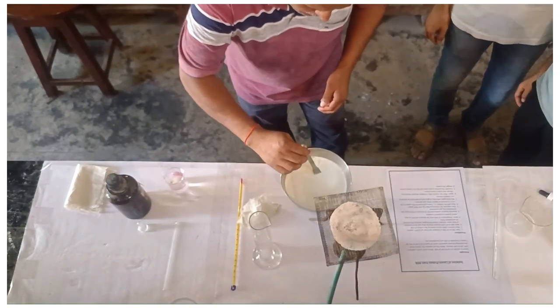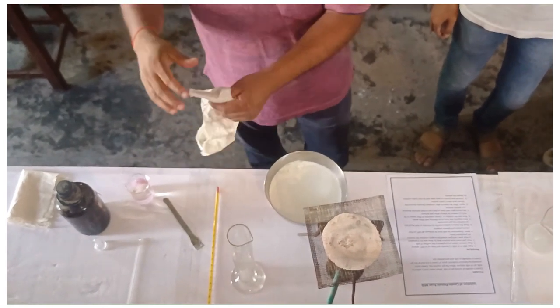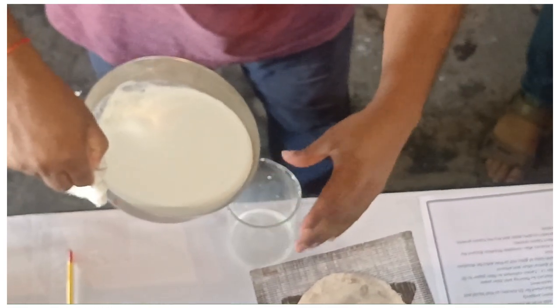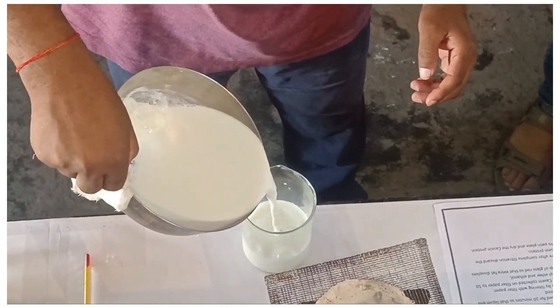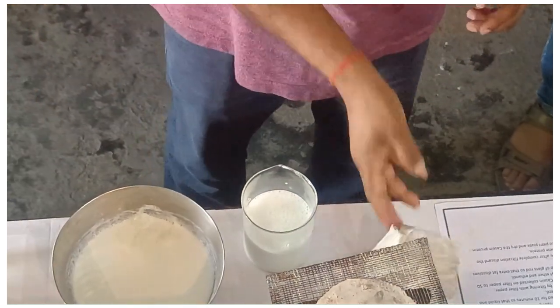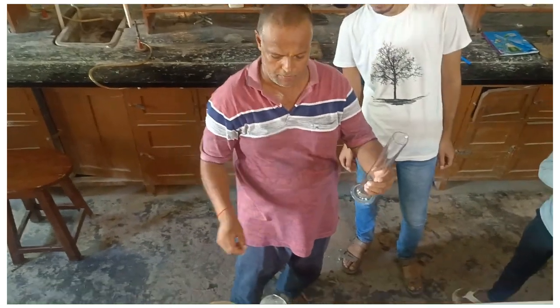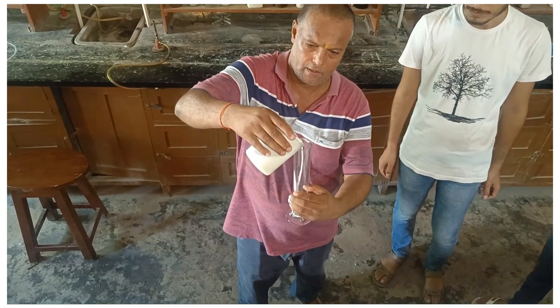We have separated the cream, and we transfer this milk into a beaker and measure the quantity. Is it clear? 100 ml. We will measure what the 100 ml is. Now we just check 100 ml of milk, near about up to this mark. Just take 100 ml of milk. Is it clear?